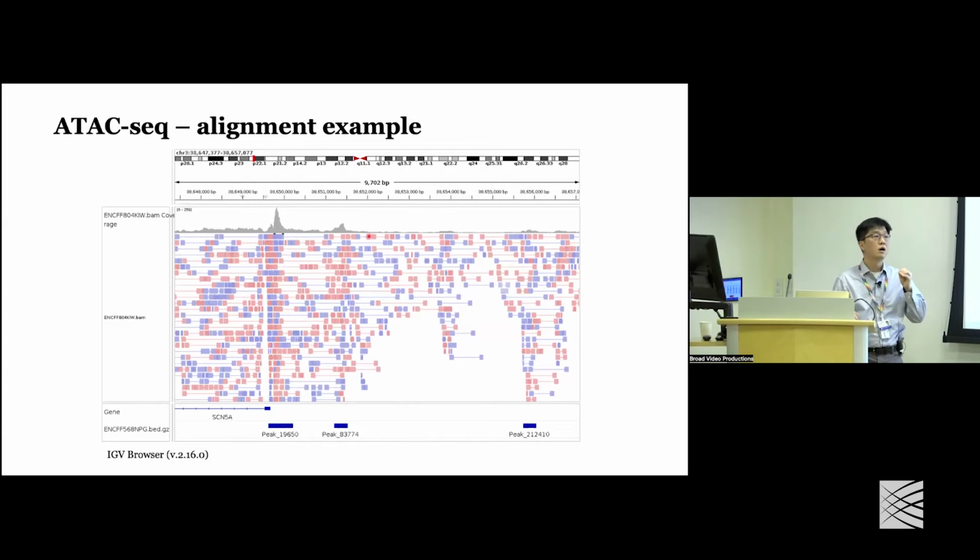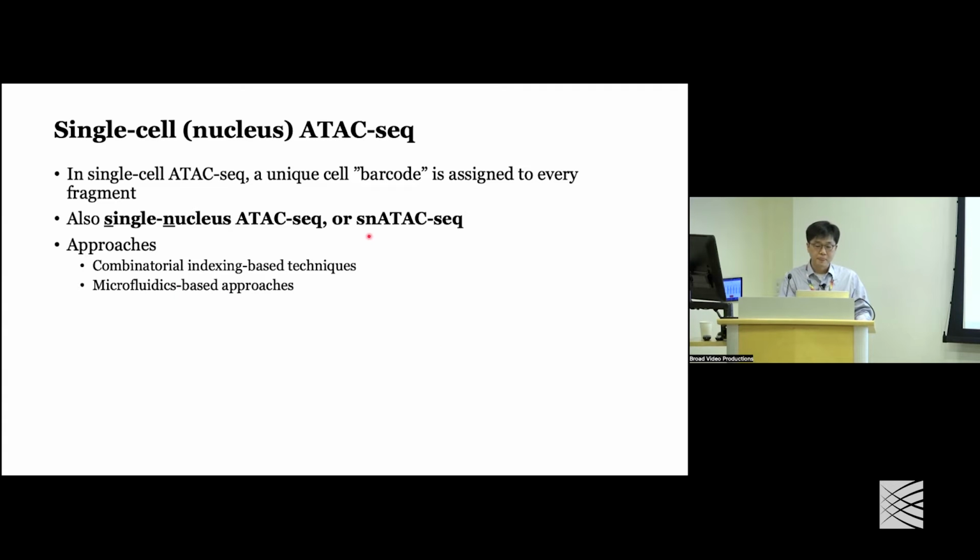Now, there are also parameters. When you do that, you really have to specify a shift size and fragment size, et cetera, but it has been heavily discussed by other pipelines. My suggestion is that you should stick to the popular parameter sets that are used by other people. Okay, great question.